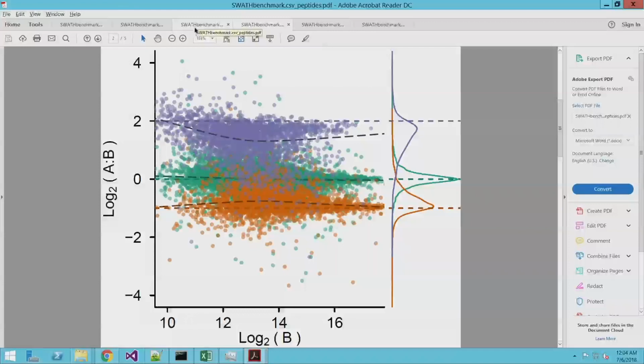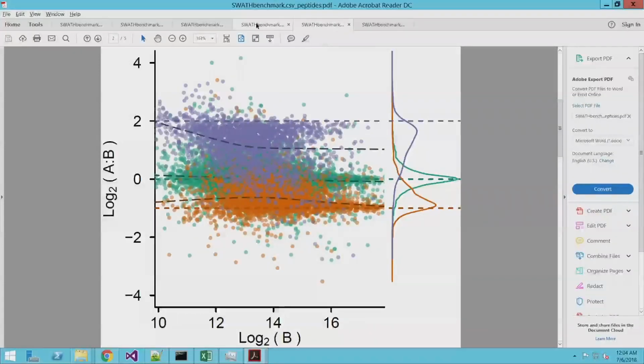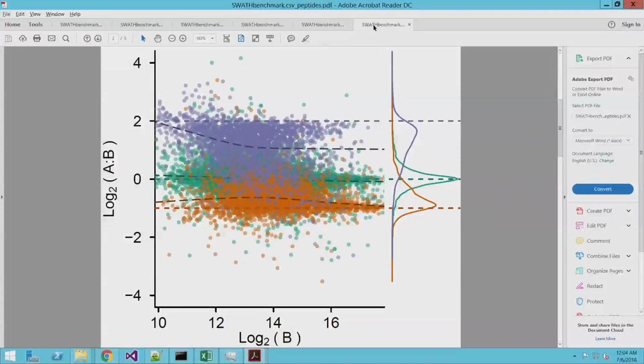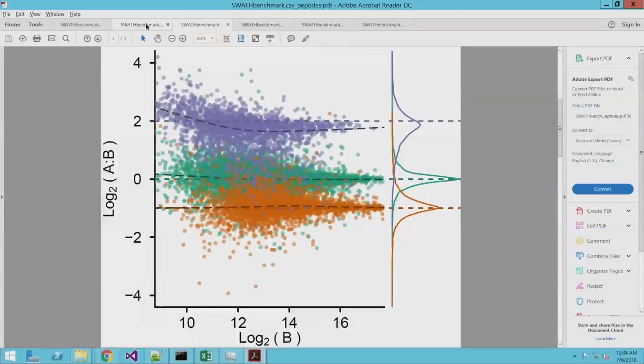But to me, already by 20 ppm, I'm getting a little bit more dispersion and a dampened effect. Everything's coming toward the middle. And if I go to 40 ppm, that just becomes more extreme, and then 100 ppm, even further still. So you can see how you definitely want to, I would suggest in your own experiments, do some of these types of analyses and understand what are going to be the optimal parameters for your instrument.